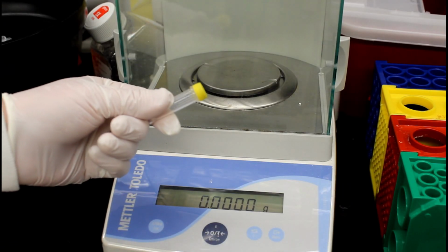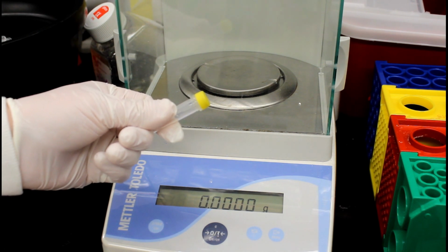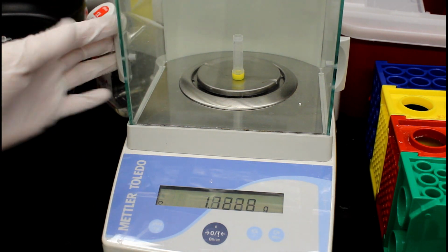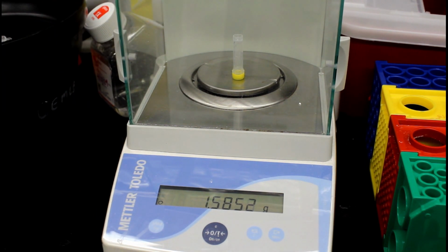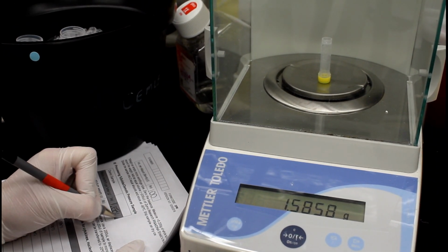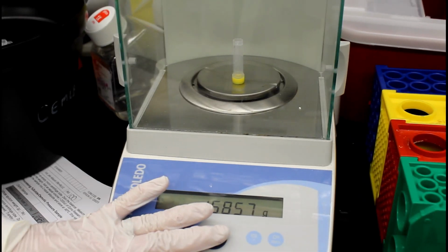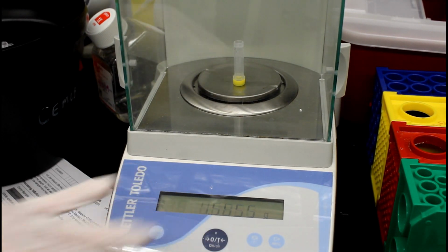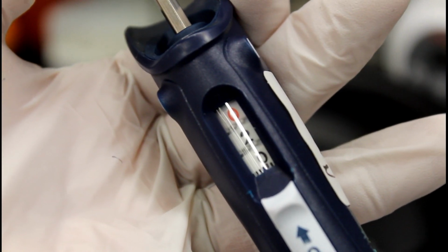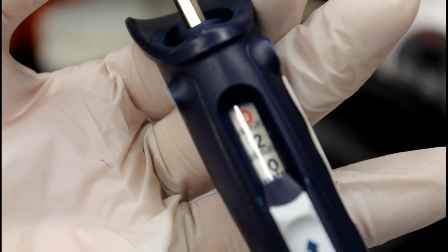The next step is processing for percent solids or osmotic pressure. Weigh an empty microcentrifuge tube and record this weight on the worksheet. Next, zero the balance. From the remaining sample, try and obtain a minimum of 0.05 grams of sample.